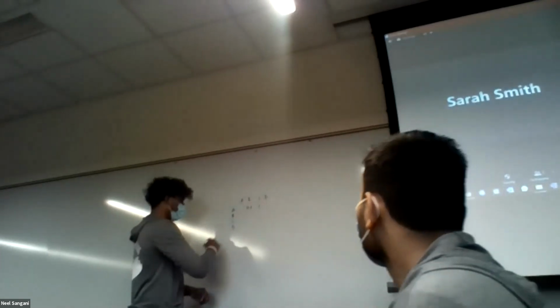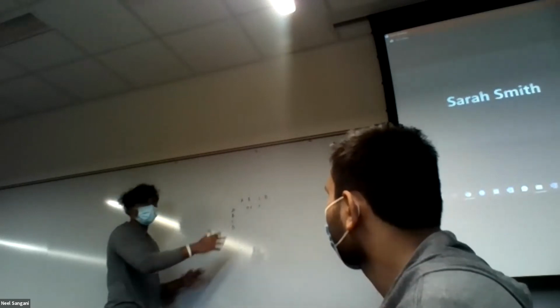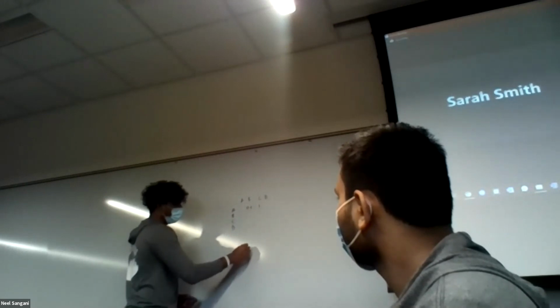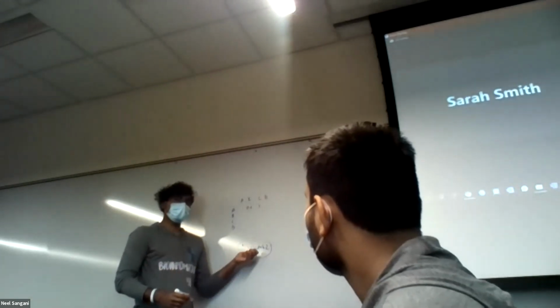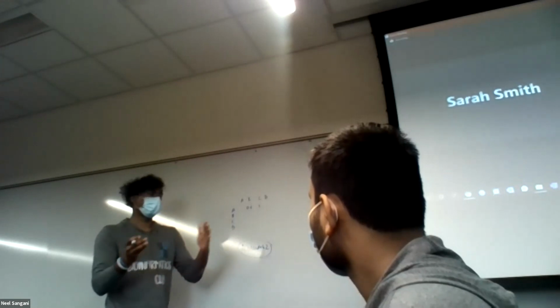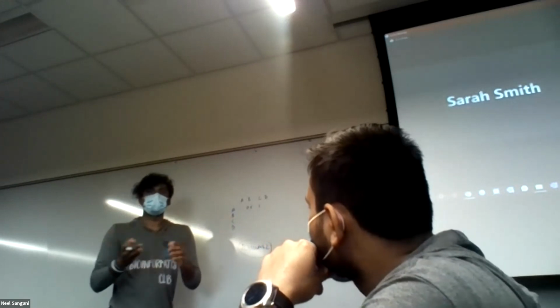They have one huge mathematical formula for creating this whole matrix, and that is BLOSUM 62, which is only for local alignment, when you know that those sequences are very similar already.